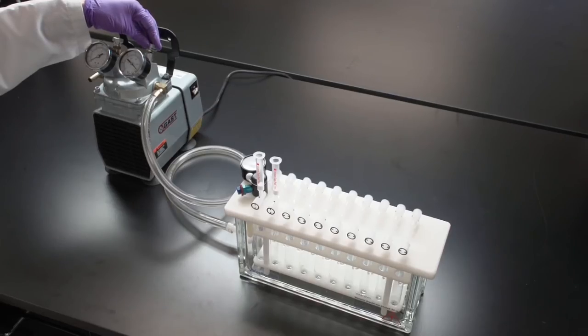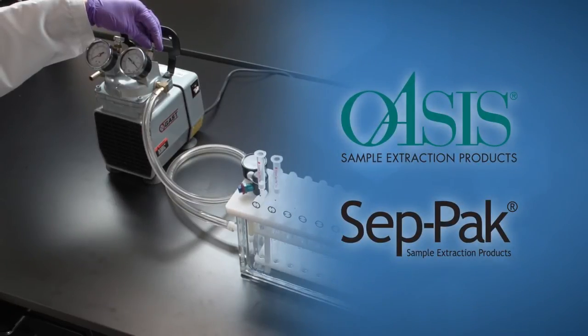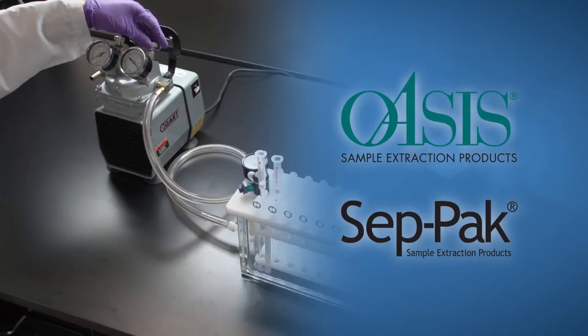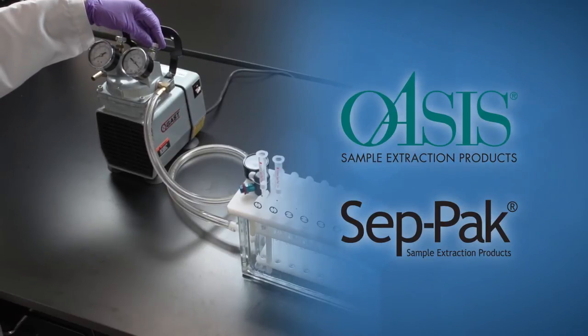If you are using a water-wettable sorbent like Oasis, stopcocks are not required. However, we suggest using stopcock for silica-based sorbents like setpack to avoid drying out.